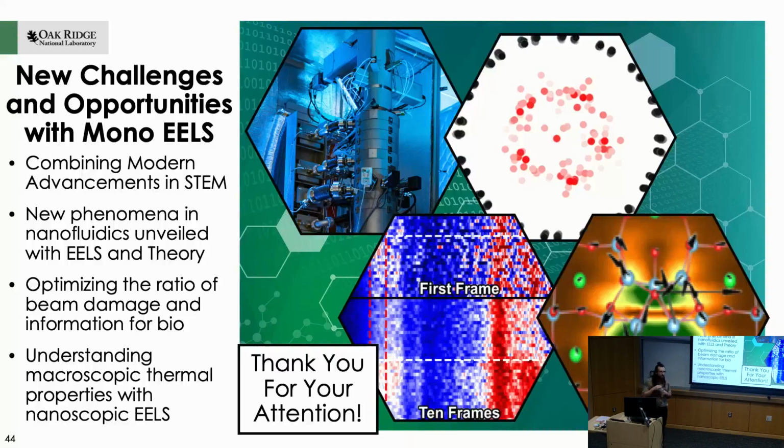Maybe this is a silly question, but I think you said you couldn't measure the density inside the nanotubes directly. Why is that? Is that just because it's within the apparatus of the EELS at that point? Well, what would the experimental setup to measure the density of the tube look like? I would consider maybe we could do mass spec or something like that and measure the number of water molecules, but how could you do mass spec from this area and really deliberately isolate what signal in your mass spec came from the tube?